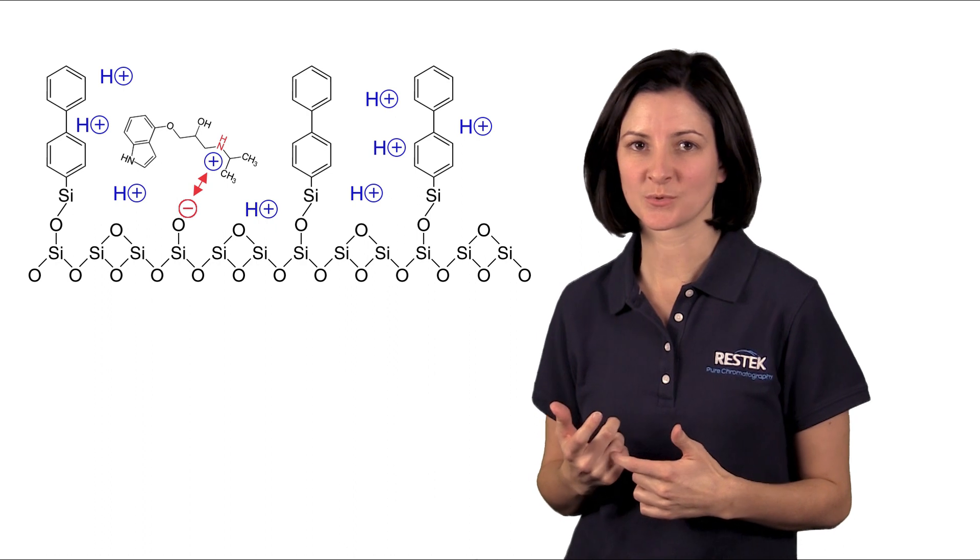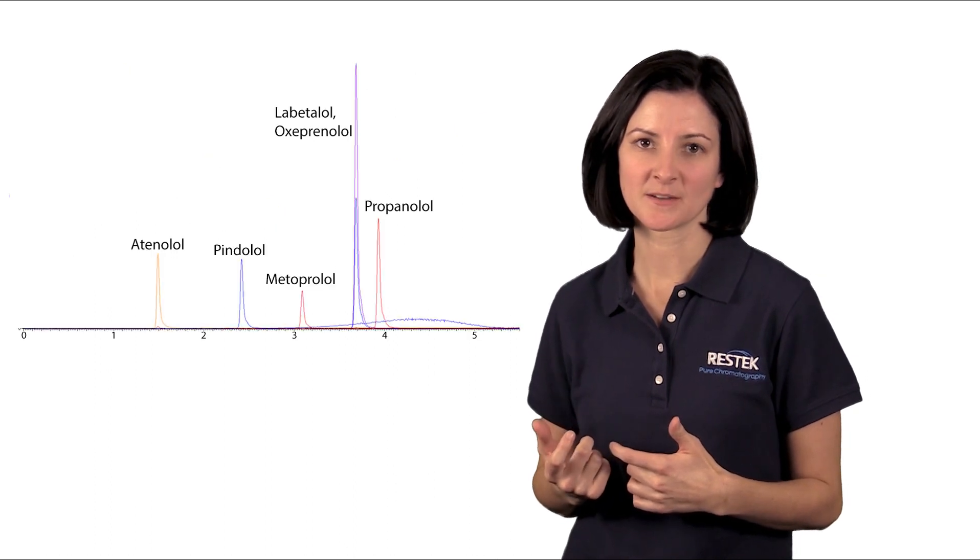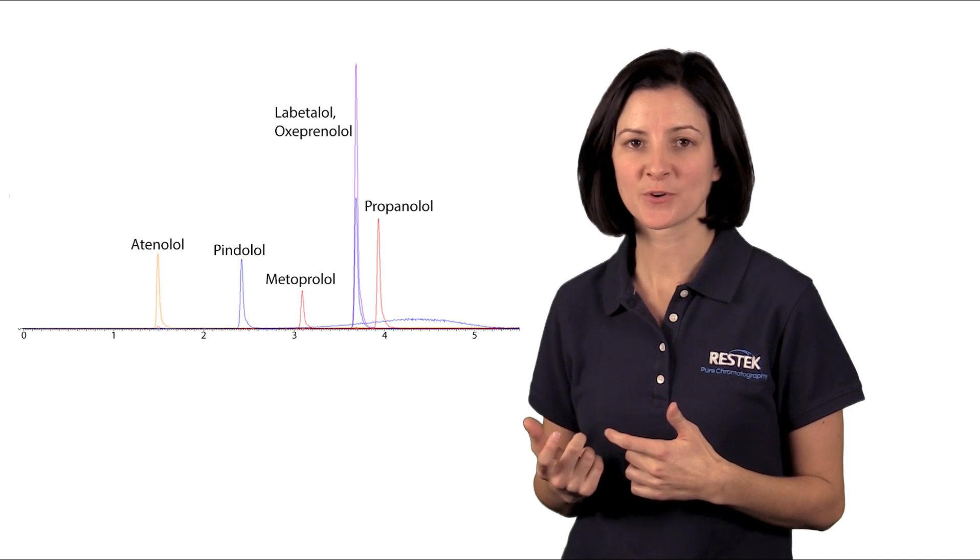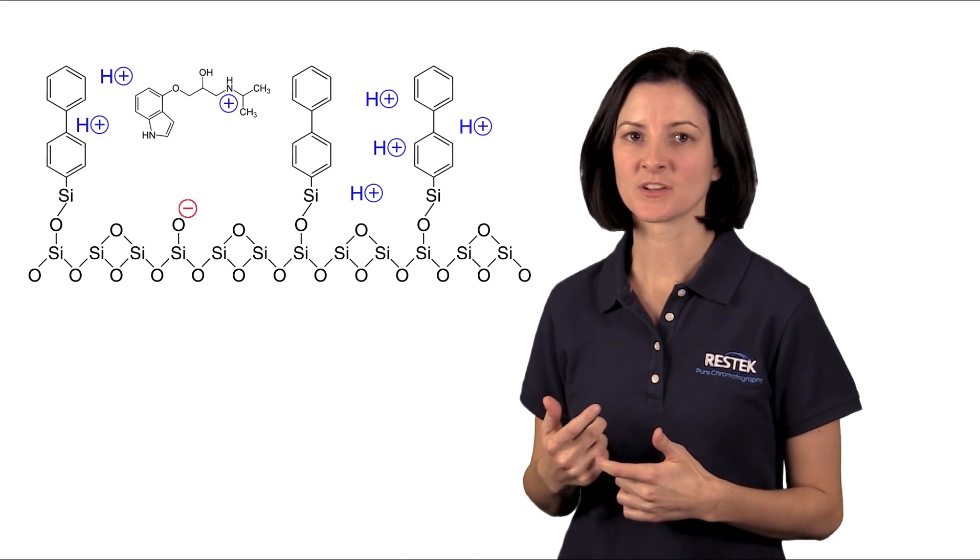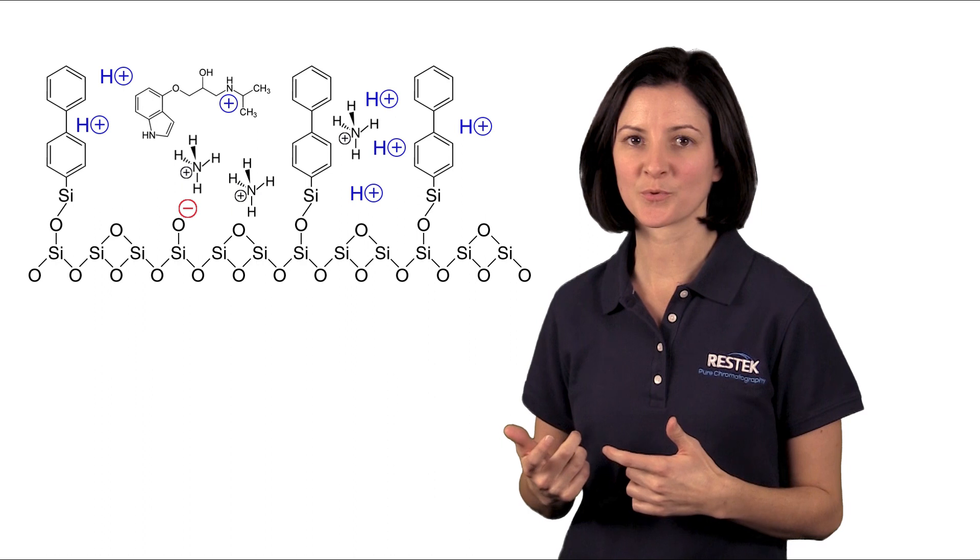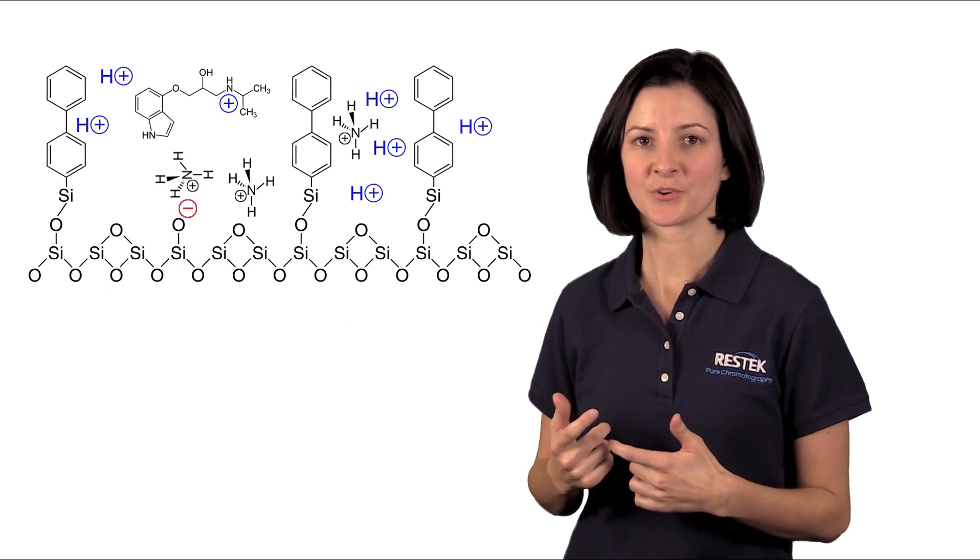That interaction is what's actually creating peak tailing. One way to actually get around this is to add buffer to your mobile phases. In typical LC-MS analysis, we're already adding acid to our aqueous and organic components of our mobile phases. But the addition of complementary salts like ammonium formate to formic acid can really help reduce some of those silanol interactions.